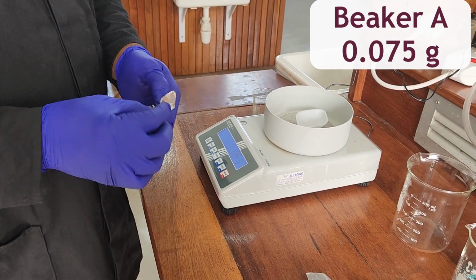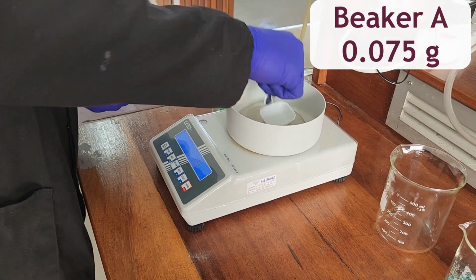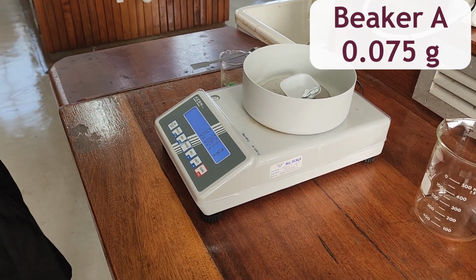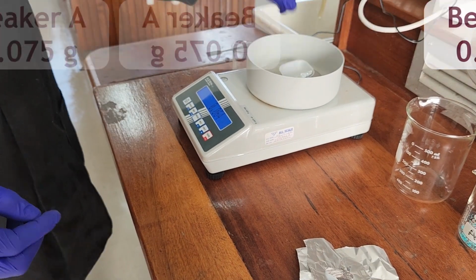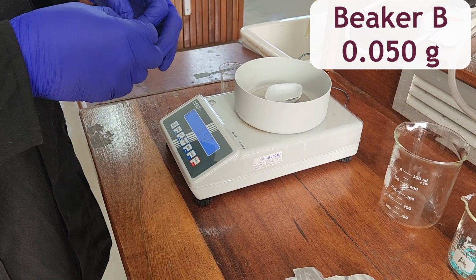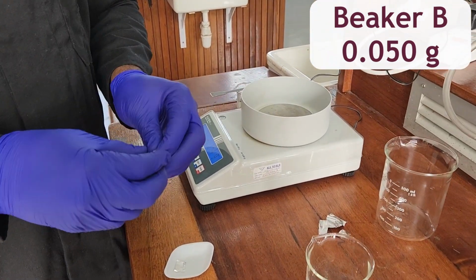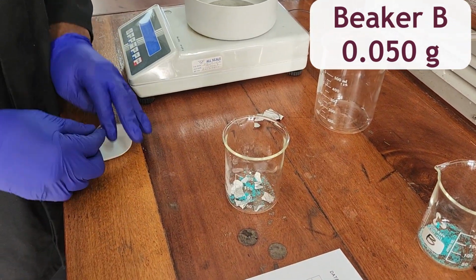Weigh off approximately 0.075 grams of aluminium foil in the plastic weigh boat and report the exact mass of the aluminium in the data report table. Tear the aluminium into very small pieces and add this to beaker A. Weigh off approximately 0.050 grams of aluminium foil in the plastic weigh boat and report the exact mass of the aluminium in the data report table. Shred the aluminium into very small pieces and add this to beaker B.